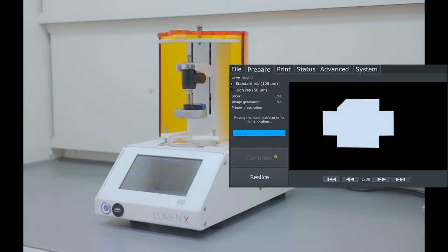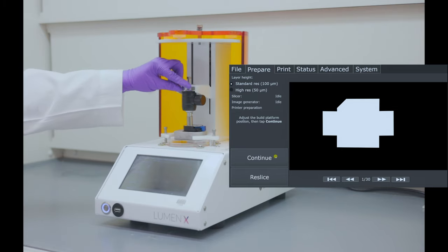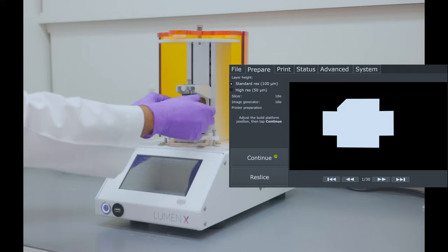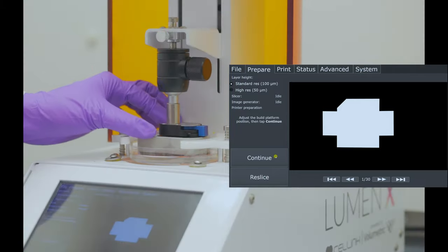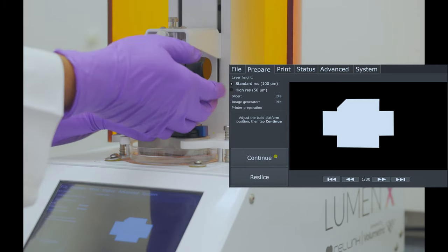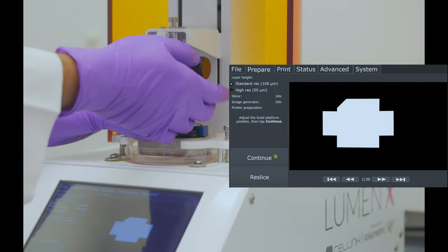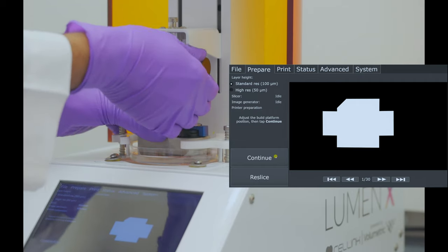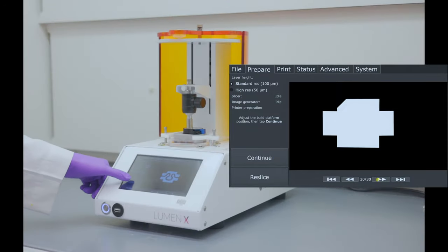Now, tap on prepare. After the build platform is lowered and stopped, loosen the metal screw and loosen the knob on the right. With one hand, gently hold the build platform onto the vat and tighten both the metal screw and the knob on the right. Now, tap on continue.